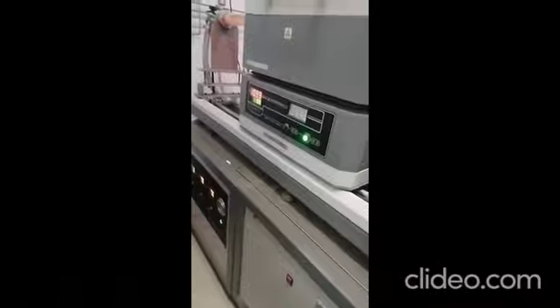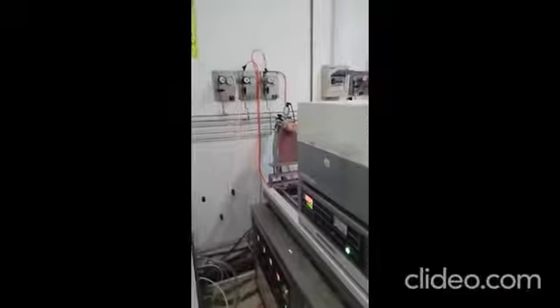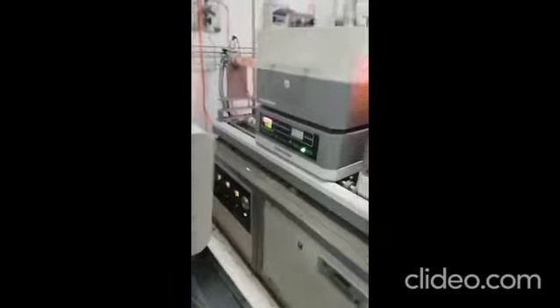Turn on the CH4 valve already. Okay. For 35 minutes. Okay.